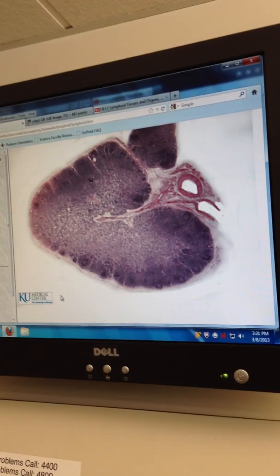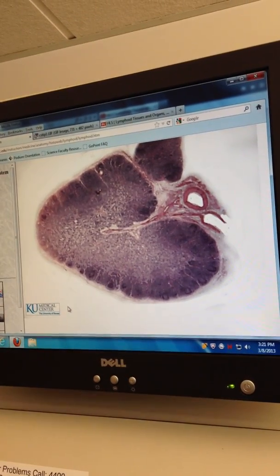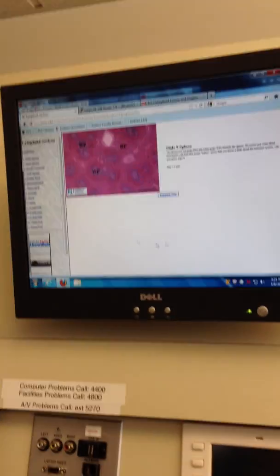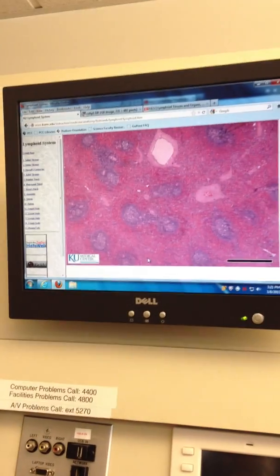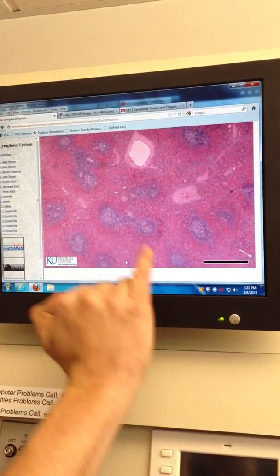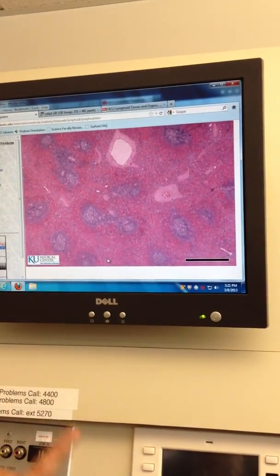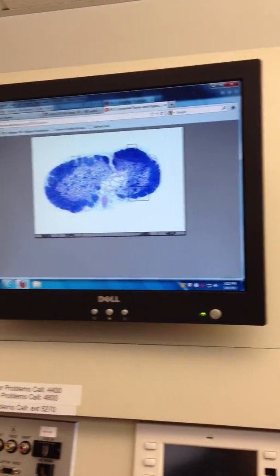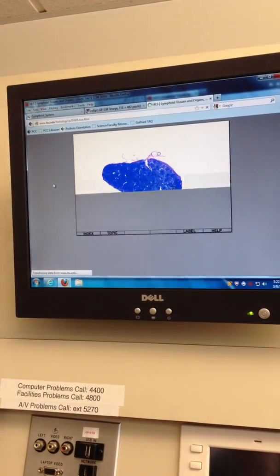The difference is, in a lymph node, you have that distinct ring thing. What changes with the spleen is the circles are everywhere. They're not in a ring. So in the spleen, the follicles are scattered. Also, you get this reddish color, not always. So what's the function of the circles? Those are where your white blood cells live.